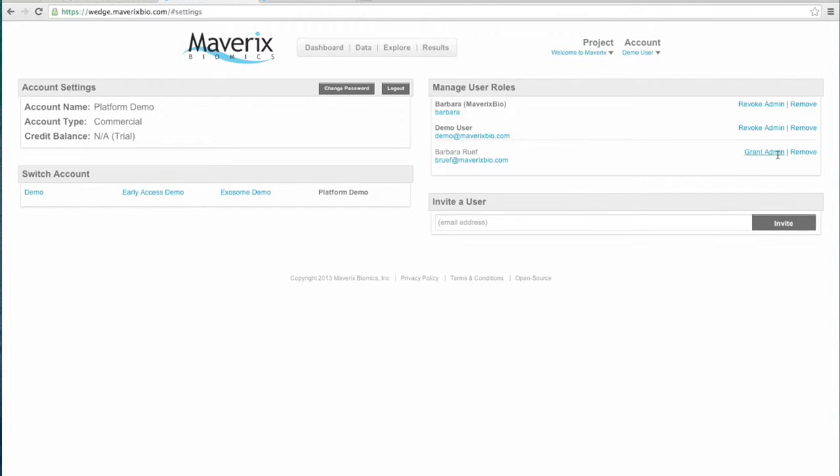From here I can actually grant admin permissions to any other user within the account. I can revoke those permissions, and I can also remove people from the account. One of the really nice things that makes it easy to add colleagues as well as collaborators to your account to share your analyses and data is to be able to add them right from here. So as an admin within this account, I can just input an email address here for a colleague within my lab, for instance, click invite, and then they would get an email that would allow them to click a link and then register on the platform and then have access to this account for collaboration.